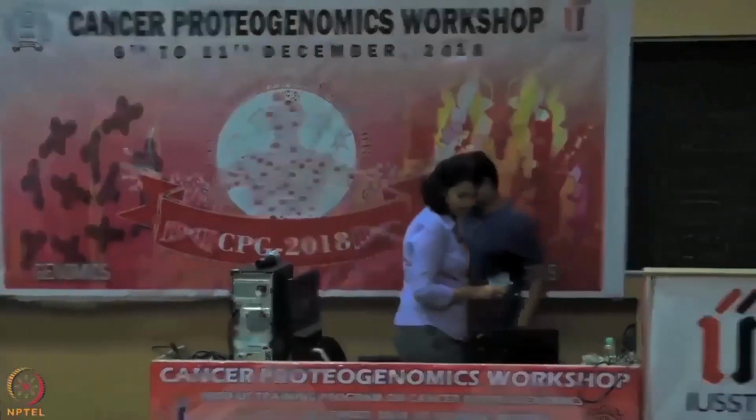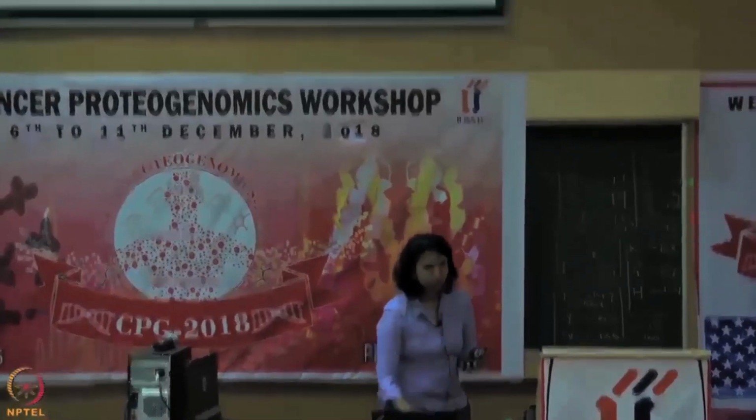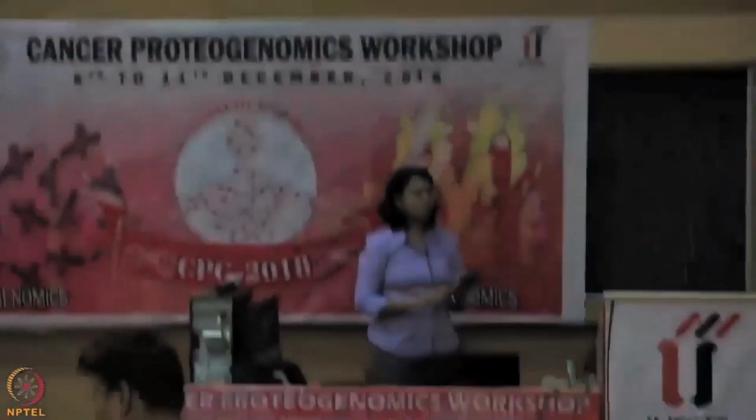Before we actually get started with the hands-on session, I wanted to show you a short video that recapitulates the Illumina sequencing technology. Mukesh did a great job of explaining all the platforms that we have and the key oncology applications and the panels that are currently available from Illumina, but we aren't sure whether the concept of reads, read lengths, paired end sequencing, and depth of sequencing is known to everybody.